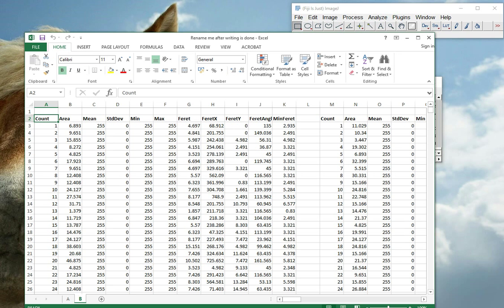Okay, so that's the use of the Read&WriteXL plugin. Thank you for listening.